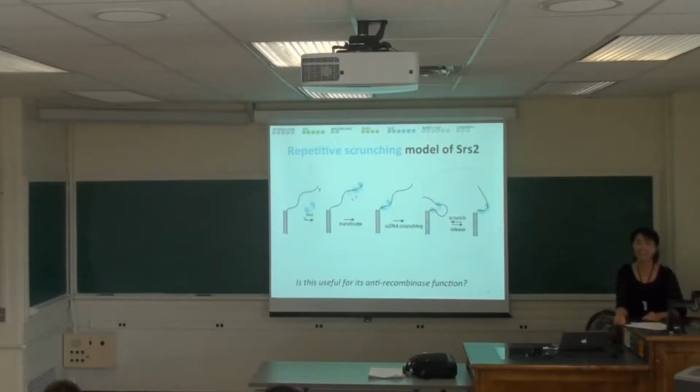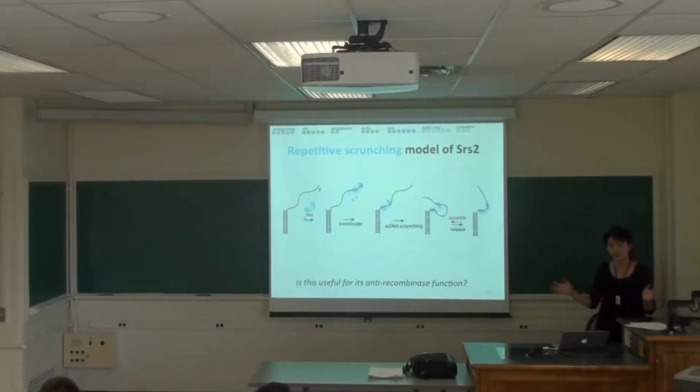But it's actually not. There are a lot of helicases, more than 100. A molecule is called a helicase if it possesses this conserved domain: there are 7 amino acid motifs, motif 1 through 7. As long as a protein has that, it is called a helicase. And it turns out that many helicases that are named this way are not good unwinders. But in this case, it is a pretty good unwinder. It depends on the concentration. In our case, we need to raise the concentration to see unwinding. What we see at low concentration, up to about 20 nanomolar, is this kind of scrunching.